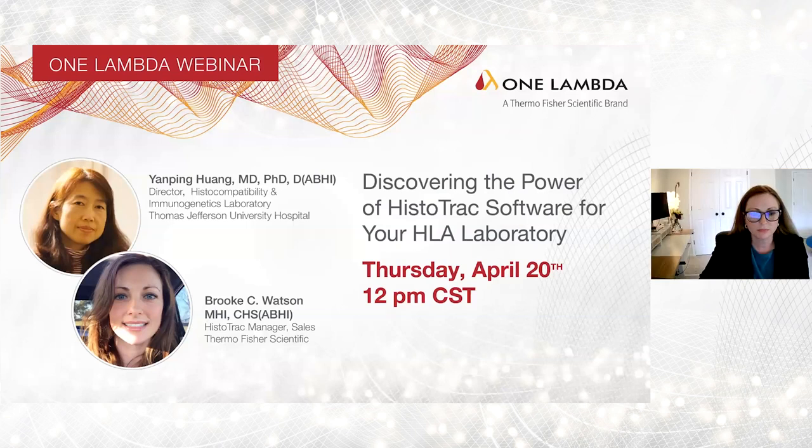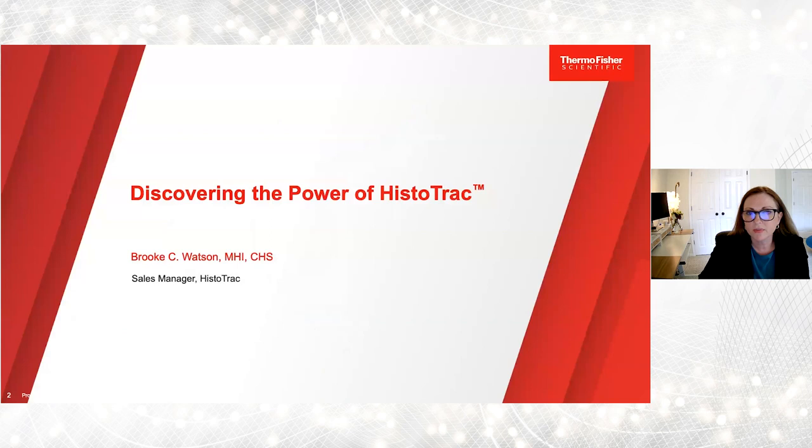Thank you, Jim. Welcome. Thank you, everybody, for attending. I hope we're in for a good trip. So the presentation today will give a little bit on how the software itself works, for people that don't quite know what it does, but it also will offer some insight into some features for the folks that are currently using HistoTrac.